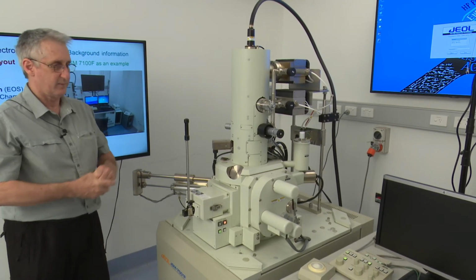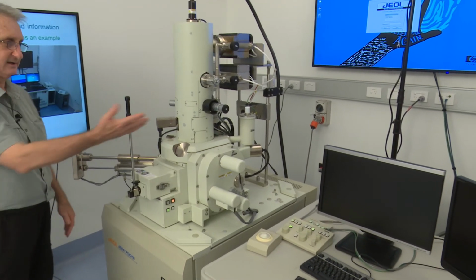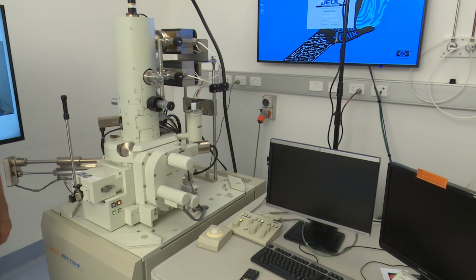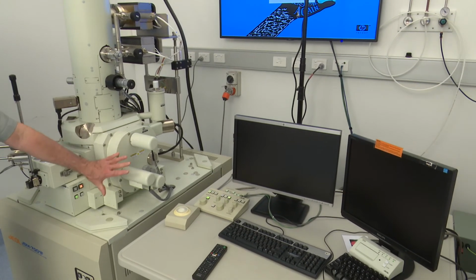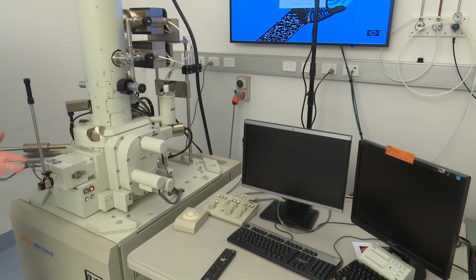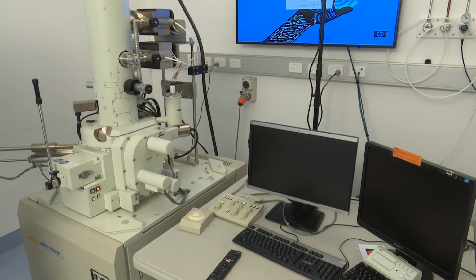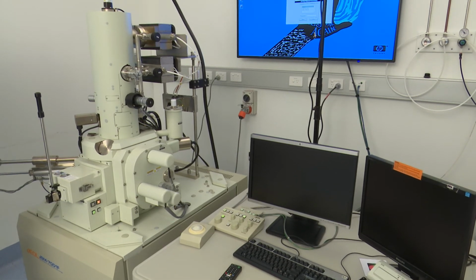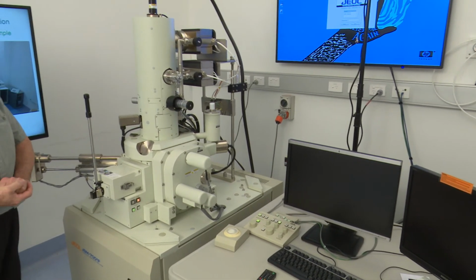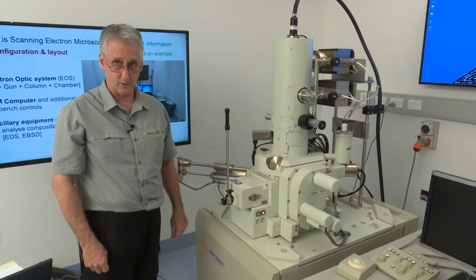And basically, I think you can see in your screen, we have a number of screens there to operate the SEM, the energy dispersive spectroscopy, drives on here for stage control, so we can move the specimen up and down, round and round, back and forth and tilted and so on. So we'll look at this machine, similar machines in a bit more detail and break down some of these components and actually bring in some of them and have a look at them.